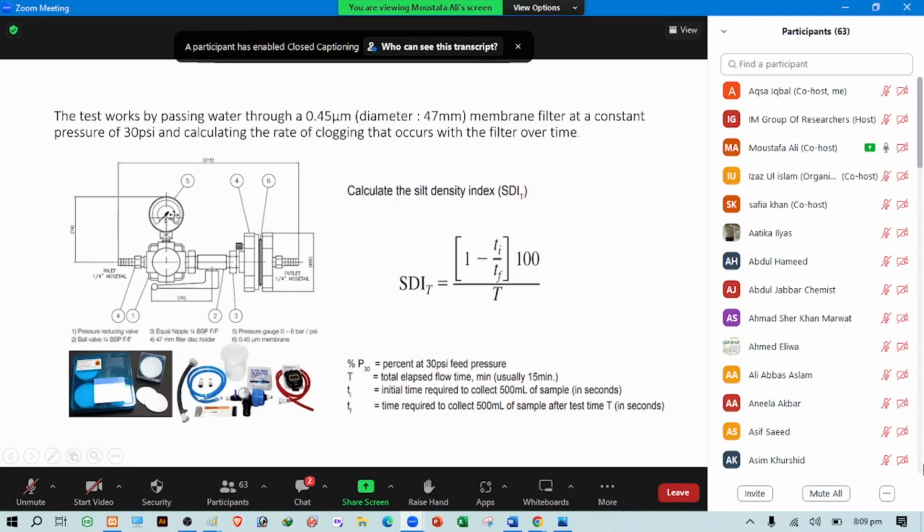And of course, the necessary hoses and a measuring flask or beaker of 1 liter. We already fixed the filter. In some techniques, we measure the weight of the filter paper, and then we start to measure the flux in a time unit. For example, we have this 1 liter container. We need to check how many minutes or seconds are required for filling such a volume.